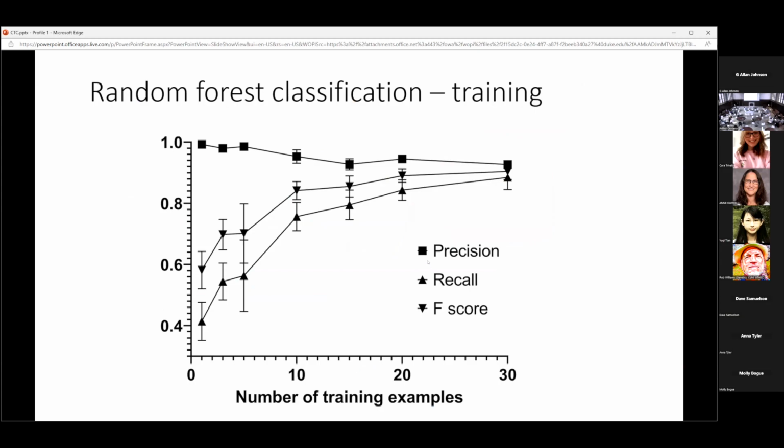The only manual part of the whole algorithm is the random forest training. This step will take less than 1 minute.